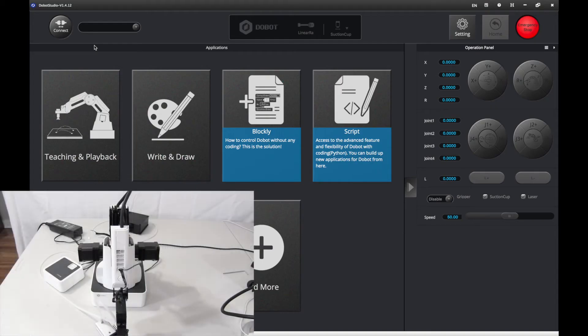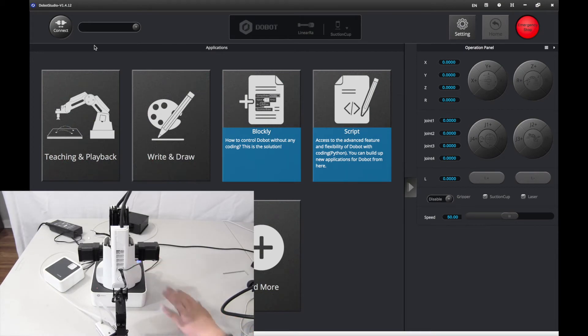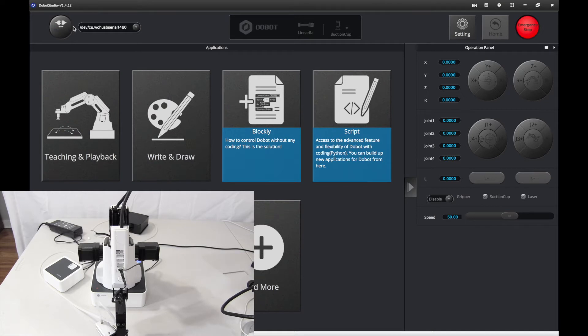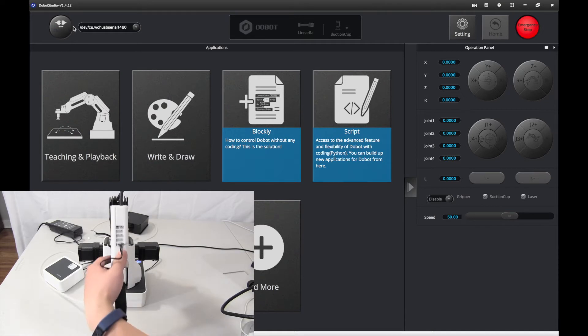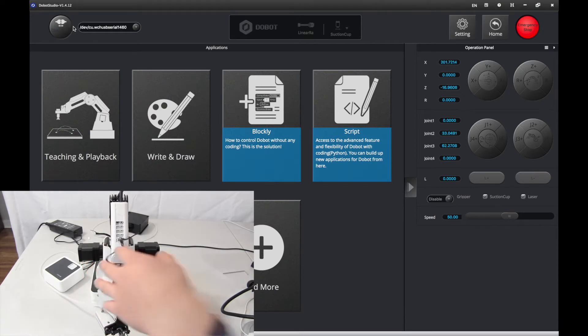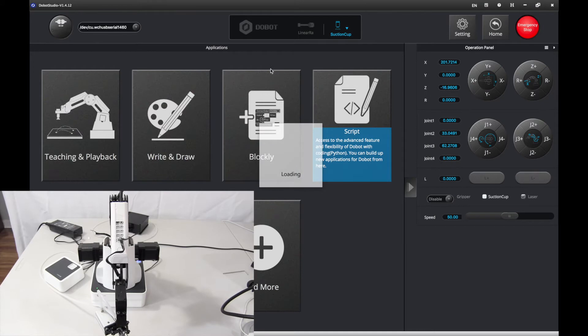Here we are, inside Dubot Studio. First, we want to power on our Dubot Magician and connect. And once it connects, you want to press home.